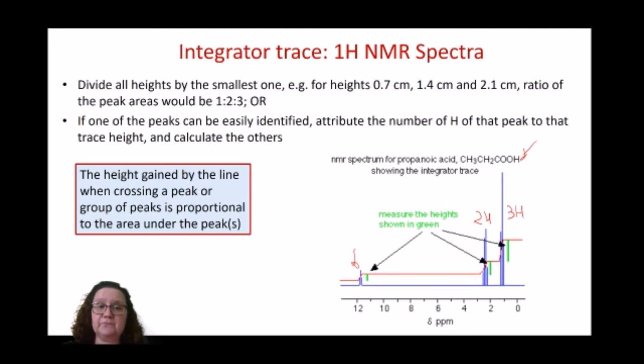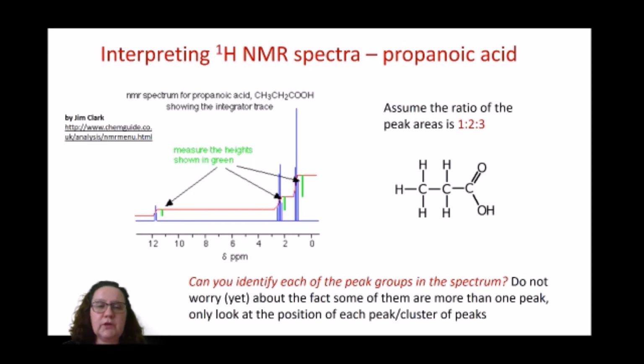So I'm going to ask you just very quickly to stop the video now and identify those 3 peaks, or those 3 clusters of peaks, because as you can see, some of them are more than one peak, and identify to which set of hydrogens those peaks correspond. Stop the video now, please.